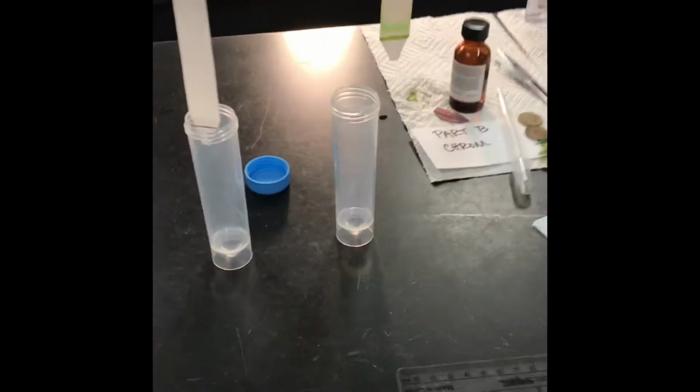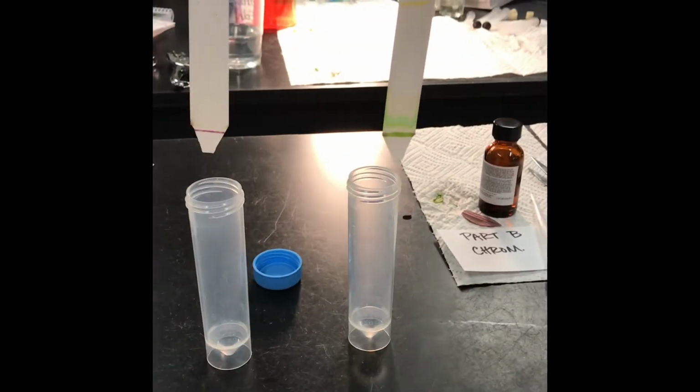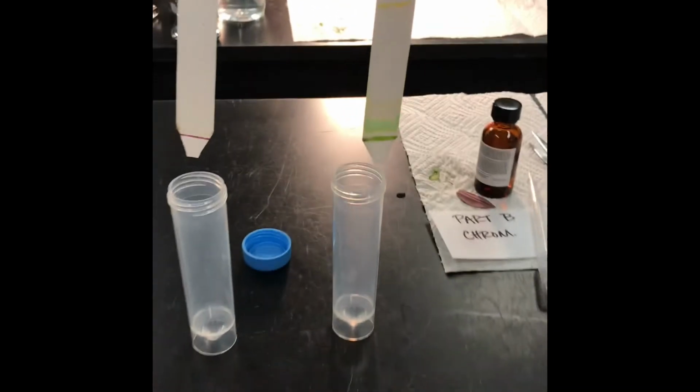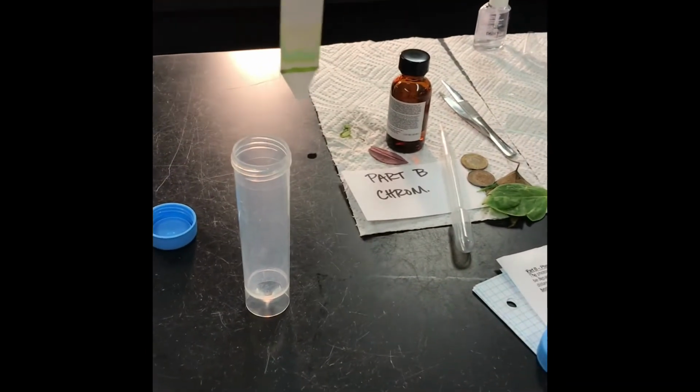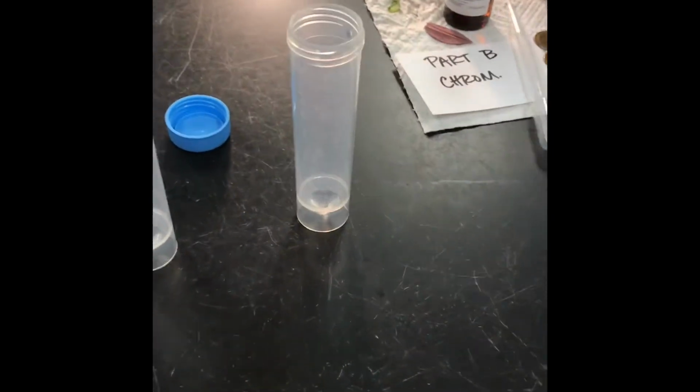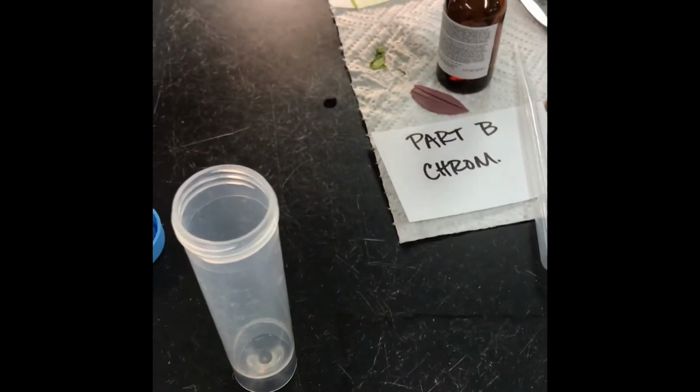We'll come back. Okay, so here's the end. We've got both of them. Ooh, that one's a beauty. So they're going to mark the solvent line on the one with the pigment, the spinach pigment. The other one you're just going to use to look at. So go ahead and put that one down. Take a pencil and mark where your solvent line is.